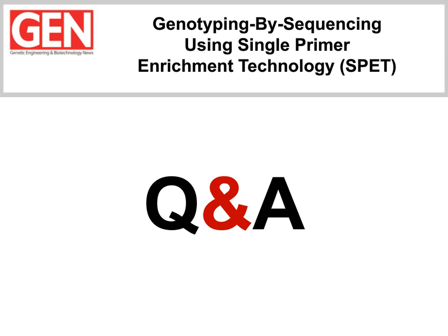And Luke, do you have any examples of compatible automation platforms for high throughput processing? Right. As we've learned, this is a process that's amenable to high throughput. We've designed the system and the chemistry with high throughput in mind, and we have automated this on different platforms to date, along with many of our other offerings.